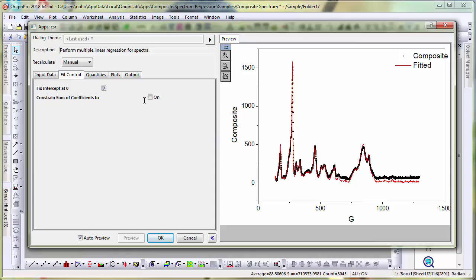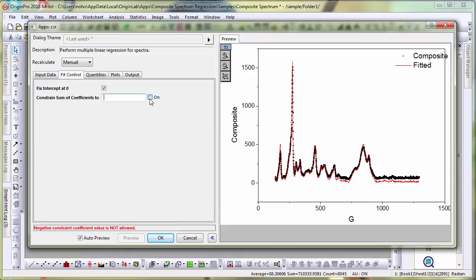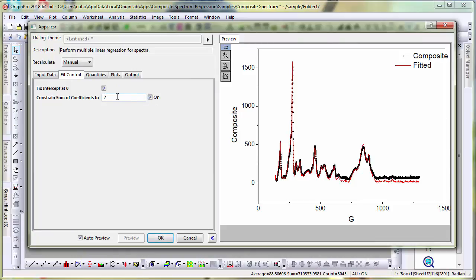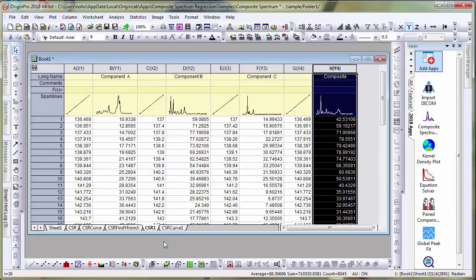This could be turned on. And in my case, I know that the coefficients should add up to 2. So I could force it to be 2 and then click OK.